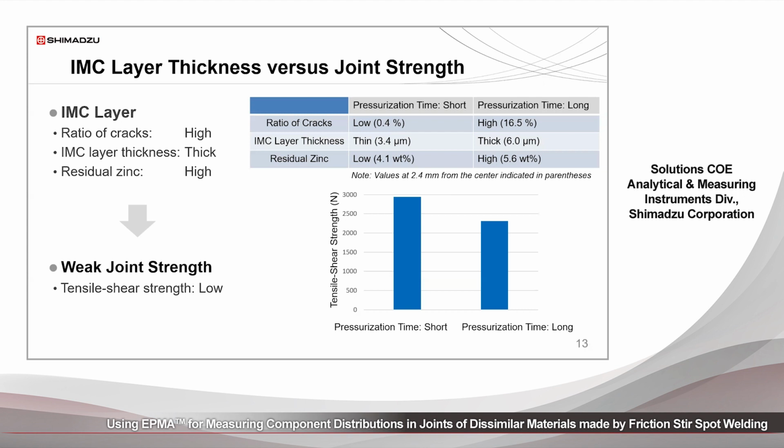We corroborated this hypothesis by using a precision universal testing machine to measure the tensile shear strength of the joint.